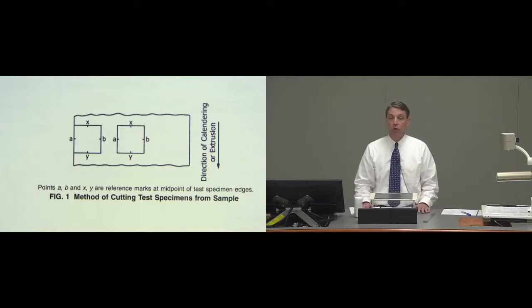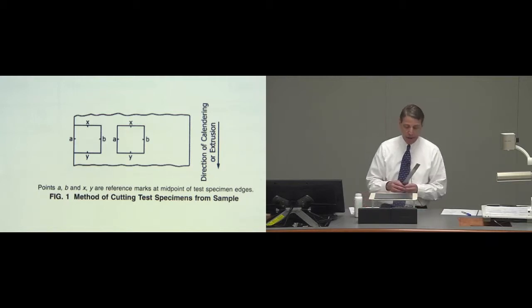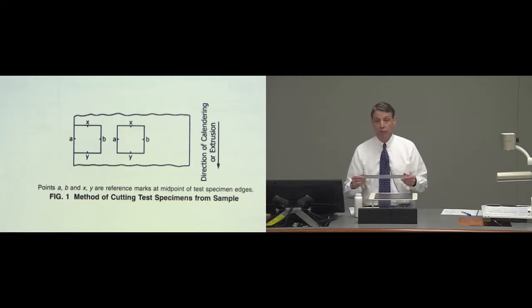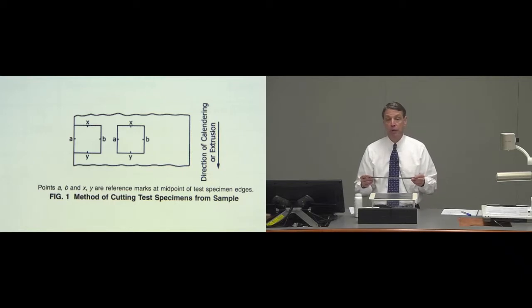So it has equilibrated for one hour and now I take a ruler. In this particular case it's in millimeters to facilitate measuring the length and width of the heated specimen.